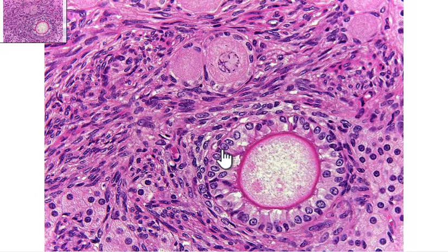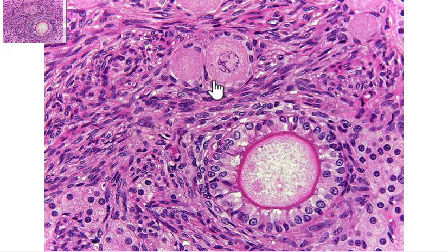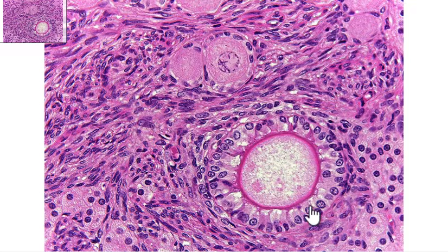For comparison purposes, this is going to be a primordial follicle up here. You can see how thin the epithelial tissue layer is. The primary one down here has a much thicker epithelial tissue layer.